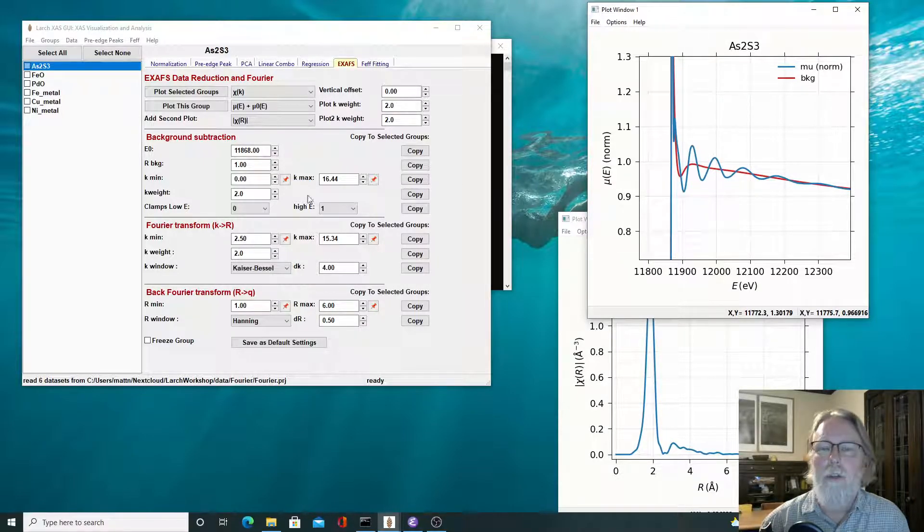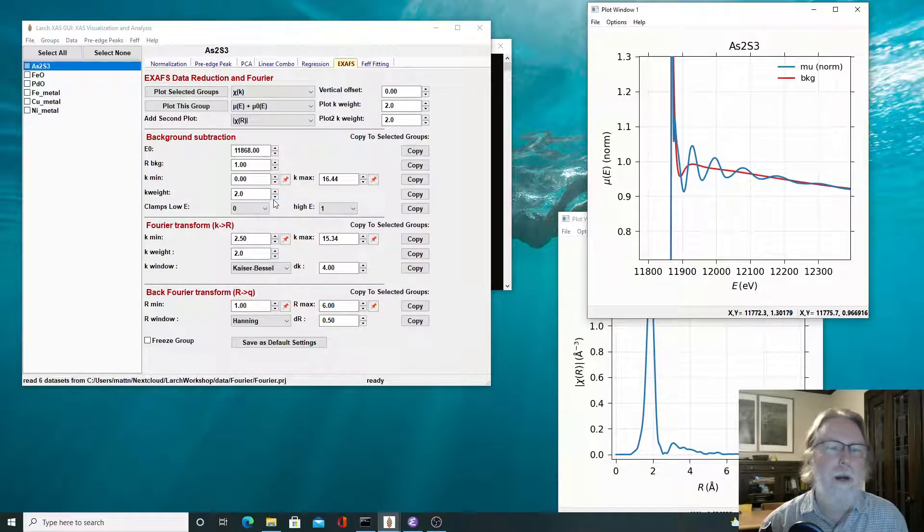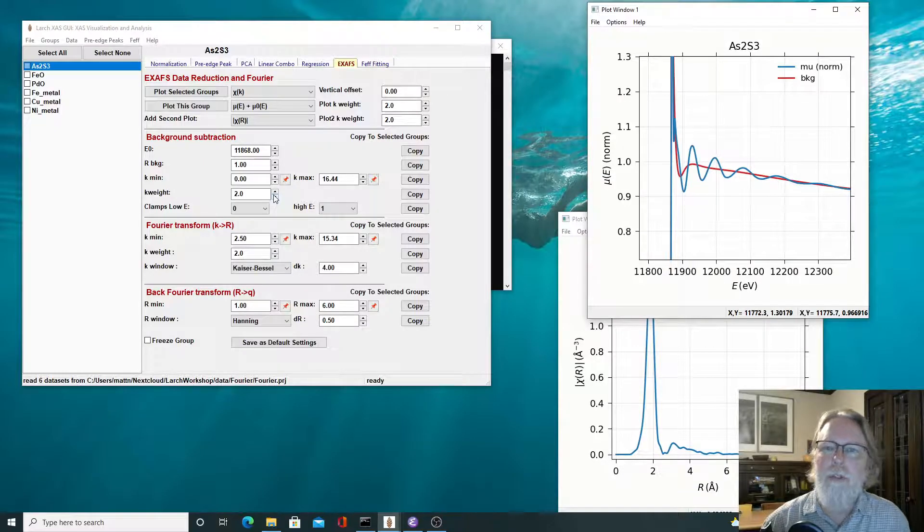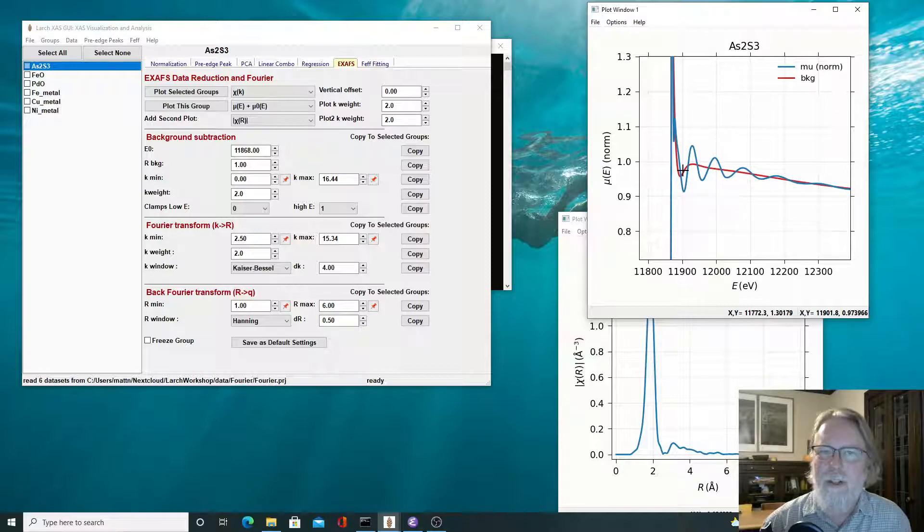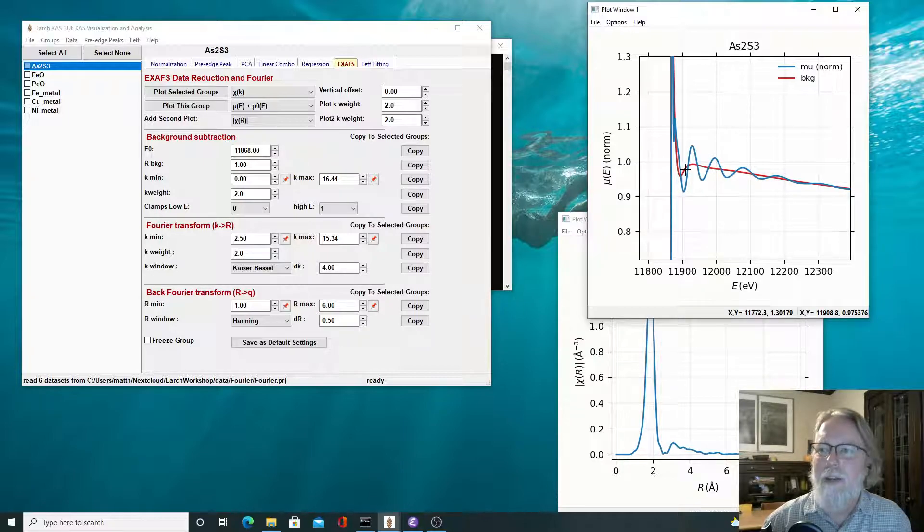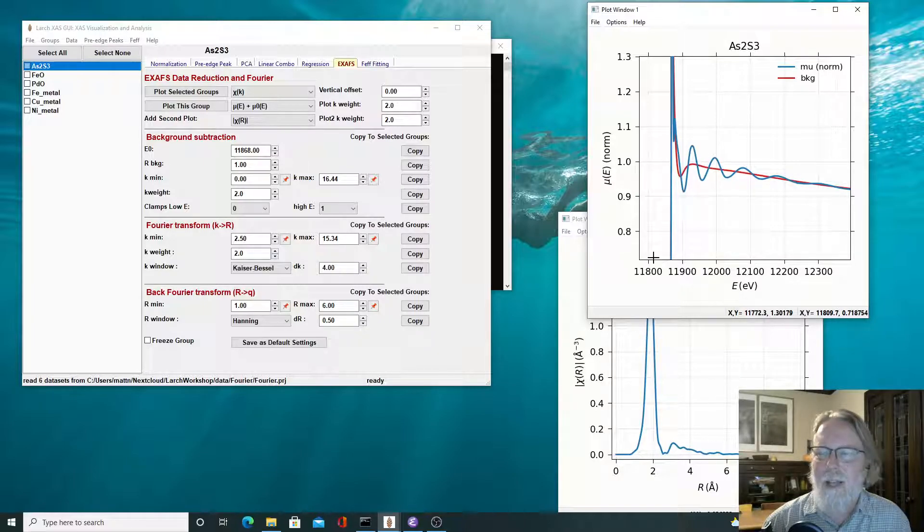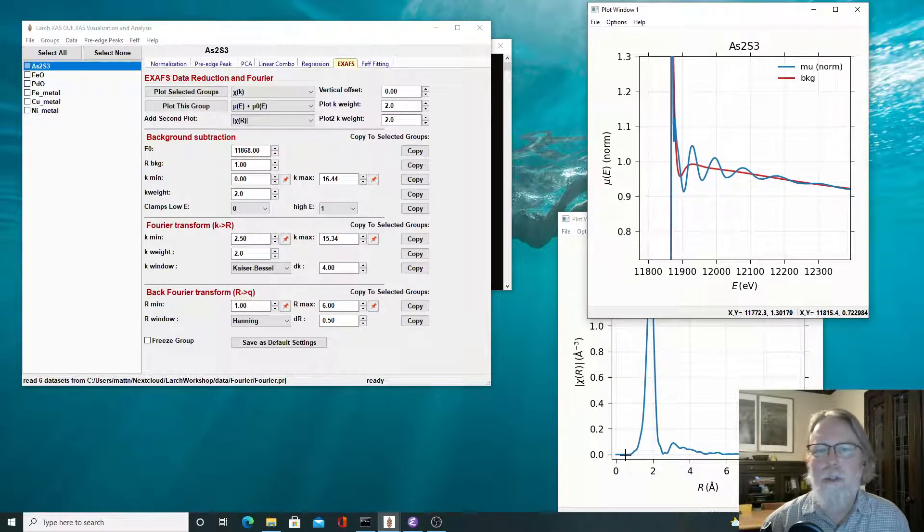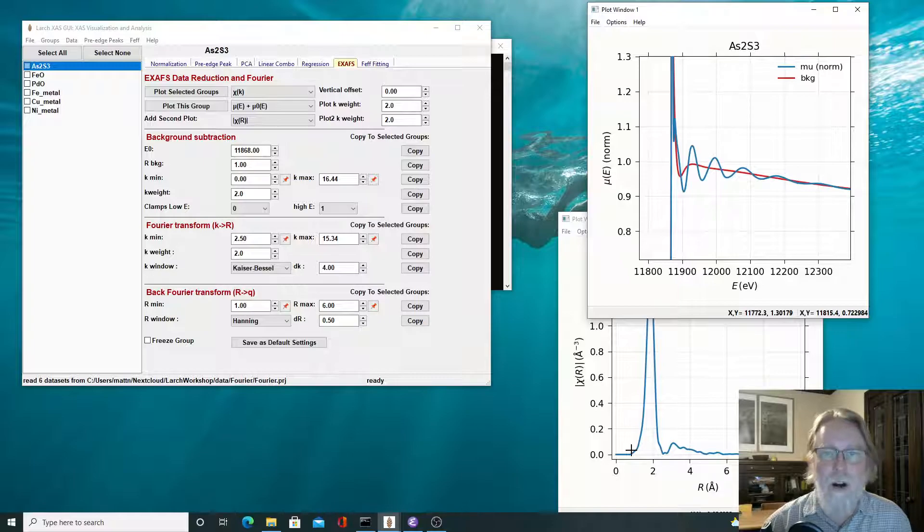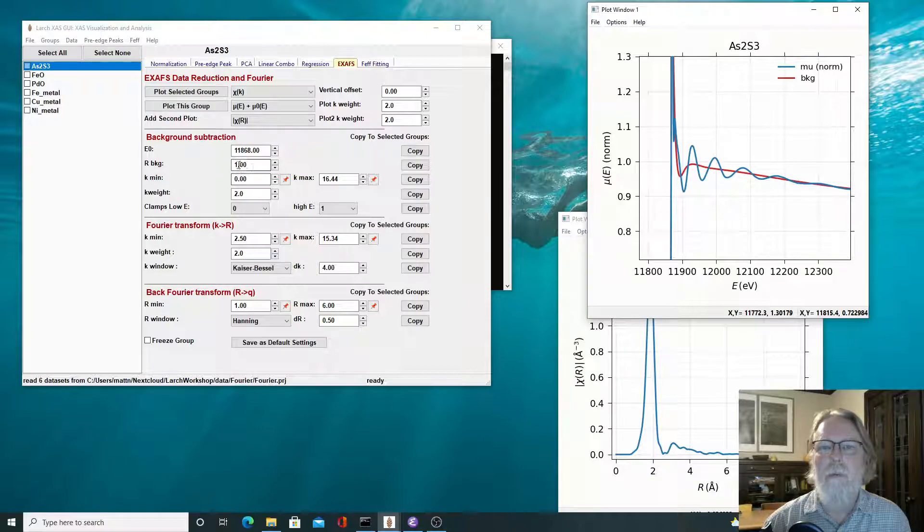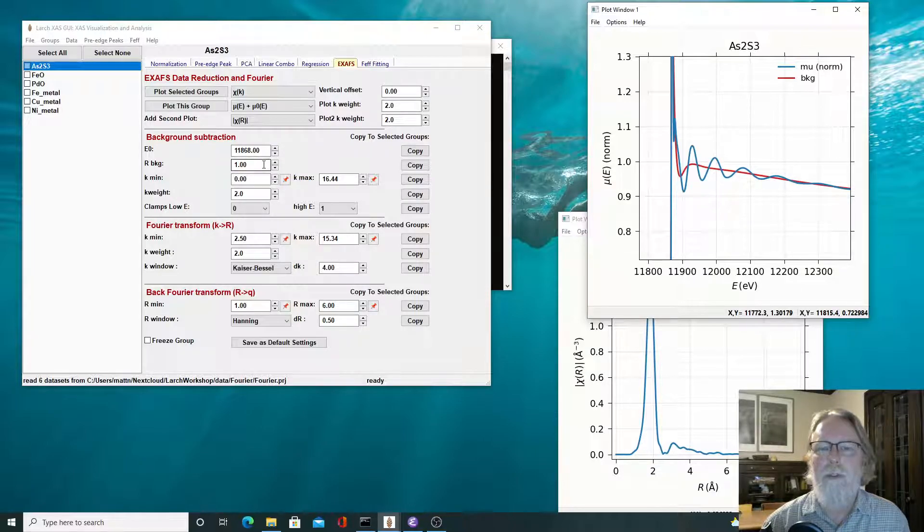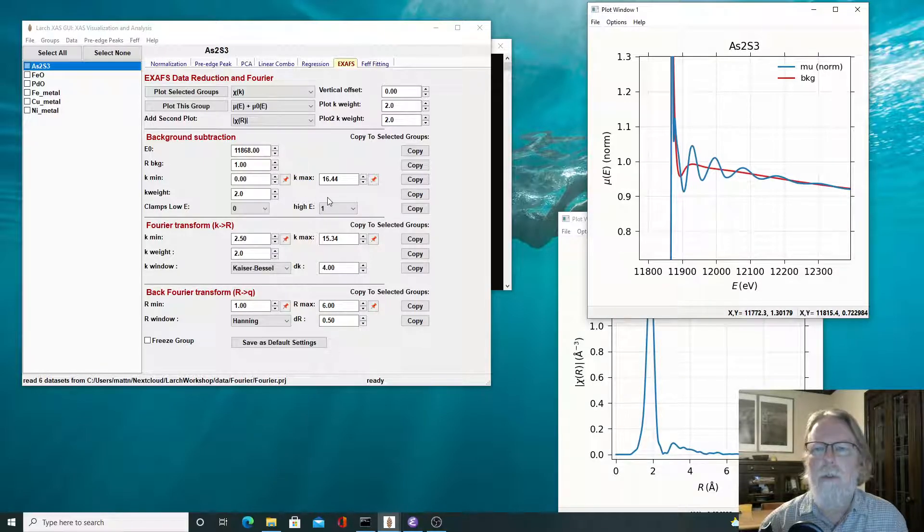And that's the value that it uses to determine what that spline function should look like. There's also a range, a K min, a K max, and a K weight, because this does do a Fourier transform. What happens to determine this function is that it picks a function, a set of variables to describe that spline function, and then it produces chi of K, then does the Fourier transform with these parameters, and finds the portion of chi of R in the Fourier transform space, and minimizes that below this value one, one angstrom.